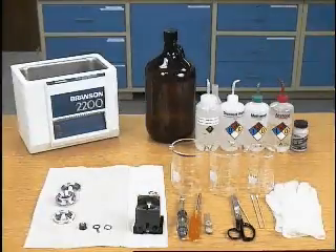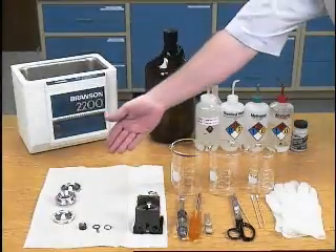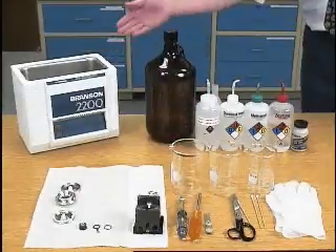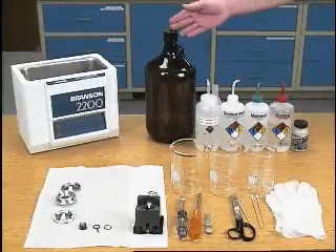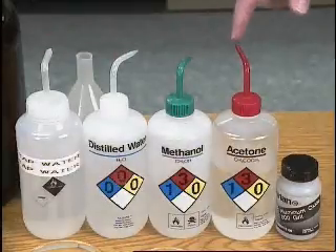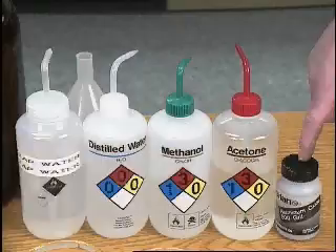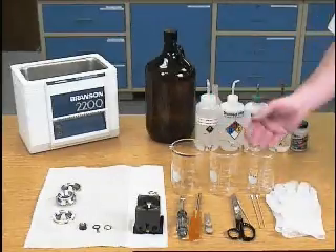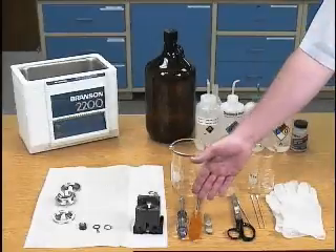The materials needed to clean the trap are the trap, trap assembly, sonicator, a waste disposal bottle, tap water, distilled water, methanol, acetone, aluminum oxide, clean gloves, some beakers, q-tips, scissors, and the trap tools.